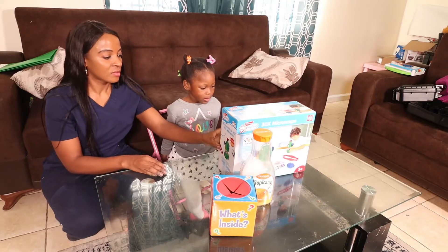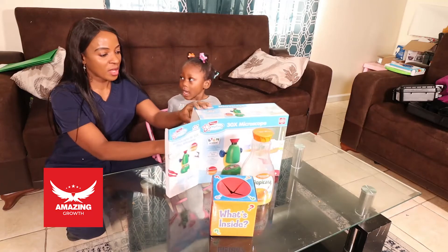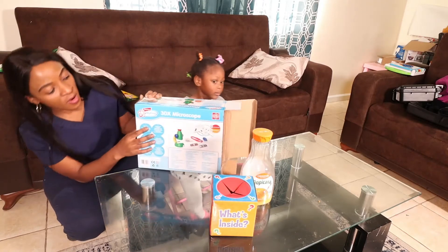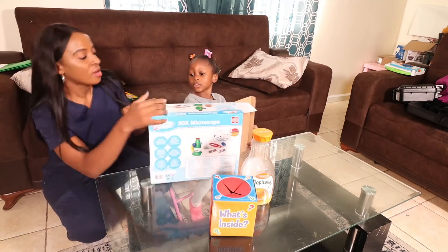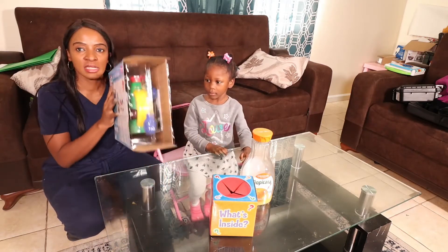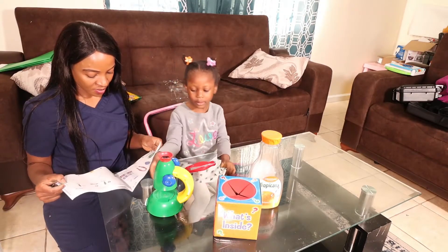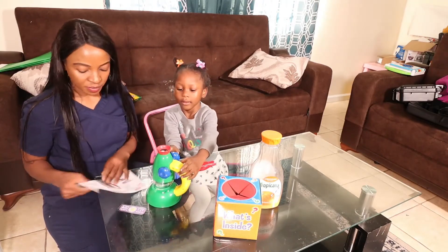Next we are going to get ready to open the box of the microscope to see what's inside and start our experiment. I am going to open it — it is actually a 30x microscope, which provides amazing details and high resolution of the specimen. 30x really means that it makes the object bigger than what it actually is.